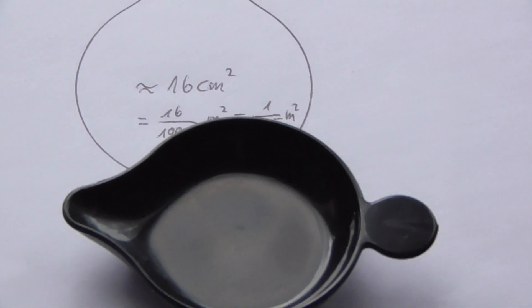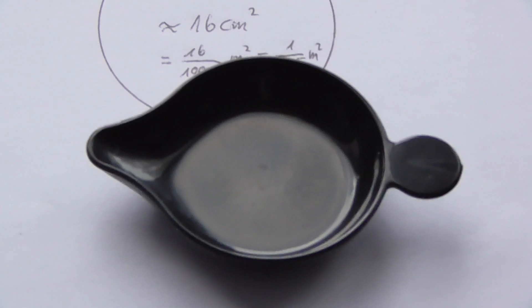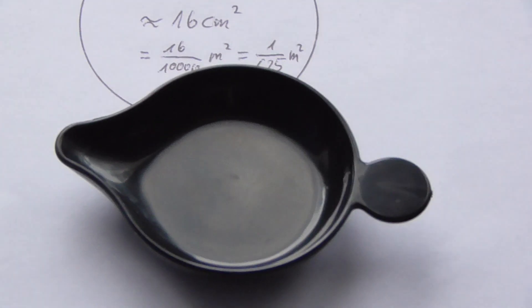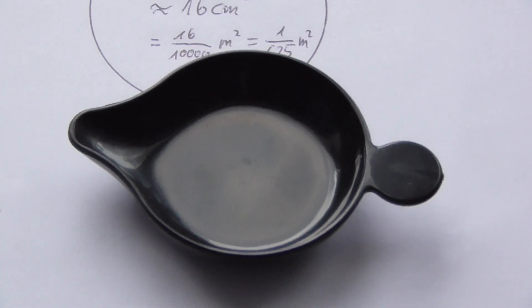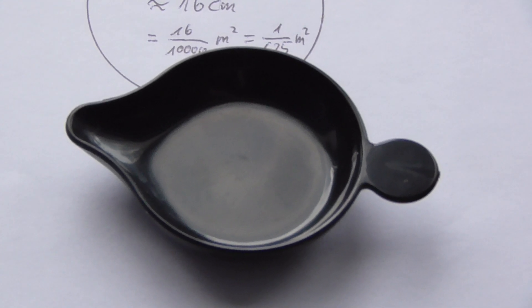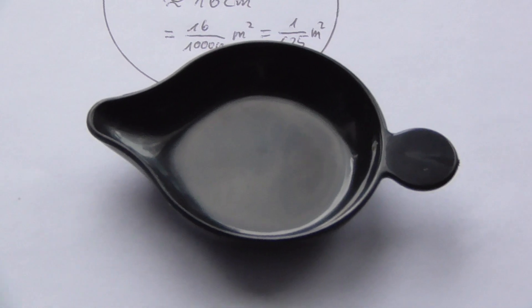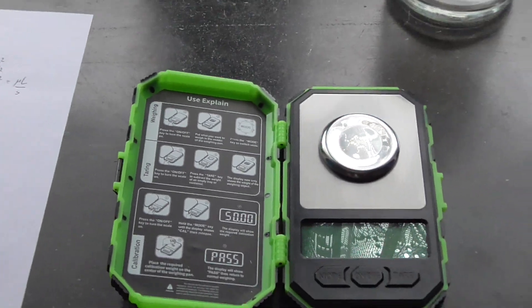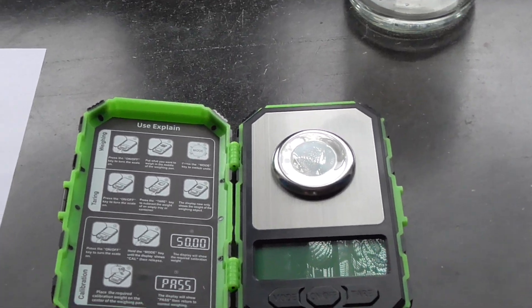So it depends on how long the water will be in the bucket and will have time to evaporate. We'll check how long it takes later, and so we can roughly calculate if the accuracy of the scale is correct at 1 milligram.